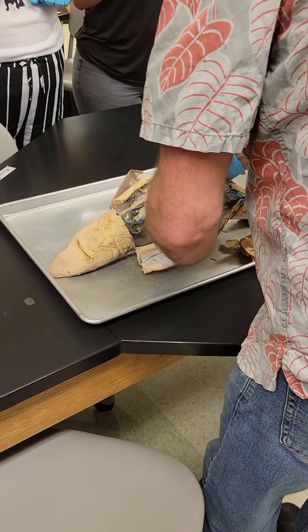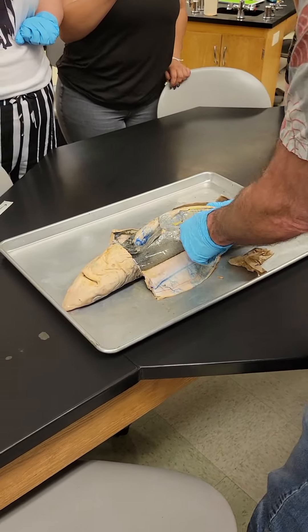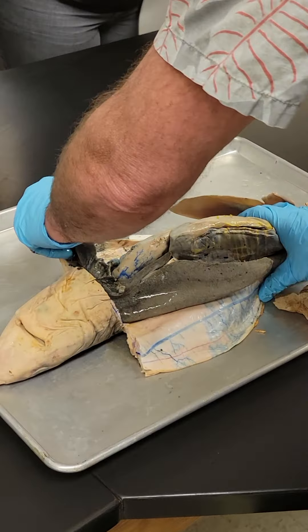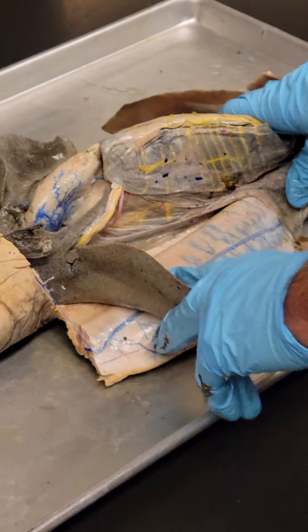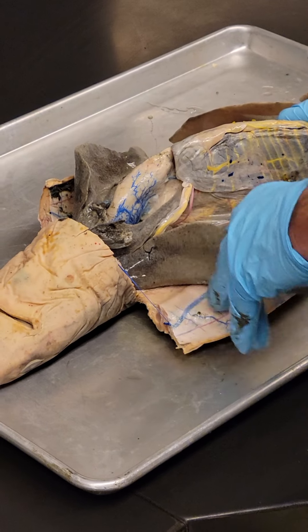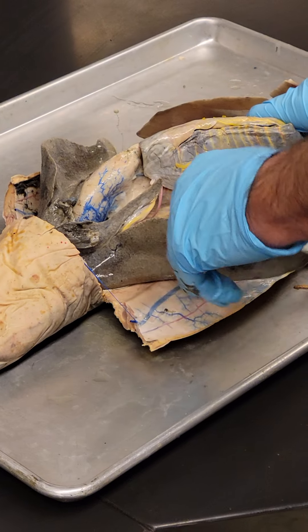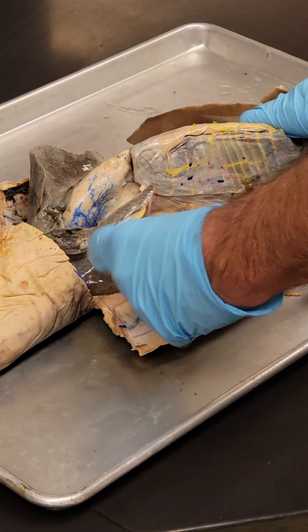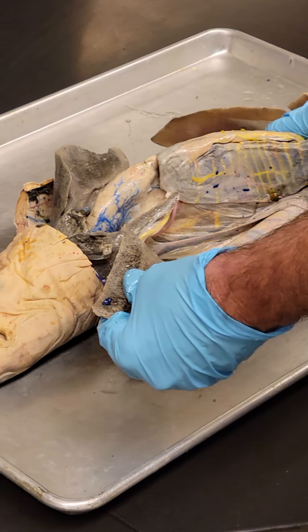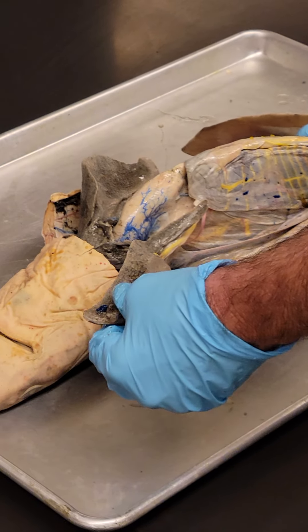So what we've got going on here — if I flare this open, the liver is a large organ on both sides of the body. It's the largest internal organ, same as in you. Its primary function is detoxifying food absorbed by the intestine — that's the primary hepatic function. It also produces fats, and in the case of fishes, they usually produce oils, omega fatty acids — these are polyunsaturated animal fats.